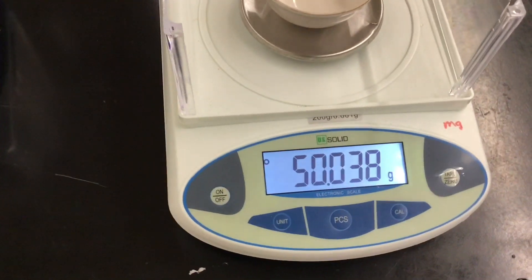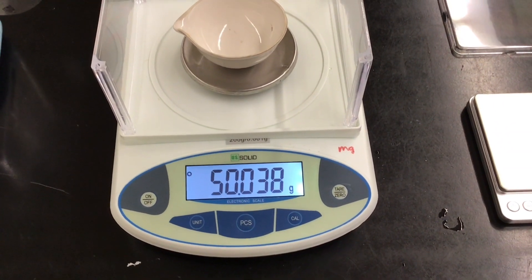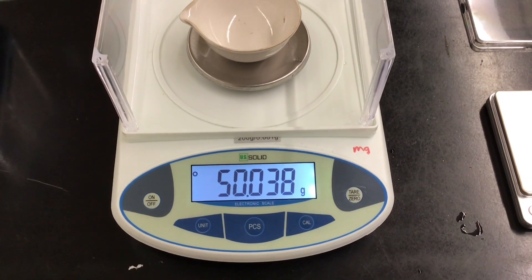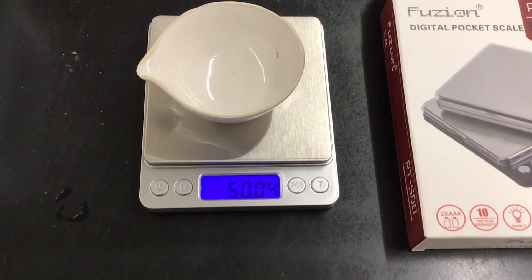These are the previous balances — this is one of my milligram balances, and I'm testing out some data. It reads 50.038, let's call it 50.04 grams. Let me put this evaporating dish on the new scale and it also reads 50.04 — not too shabby.